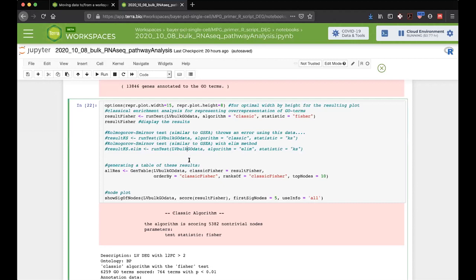But I also don't want to give a specific recommendation without knowing exactly what your conditions are. Other than I think that this is really well validated. And Fisher is a little bit more basic. Not necessarily bad, just basic.